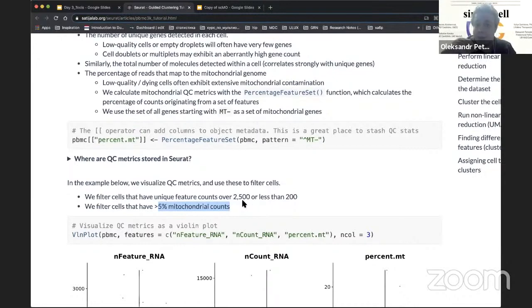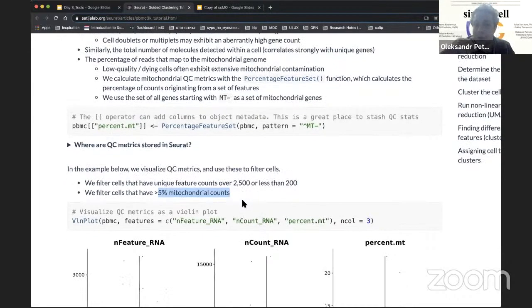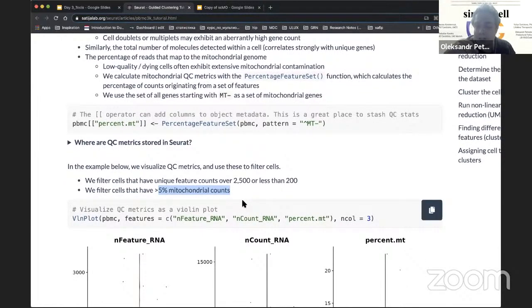For example, the hepatocytes which are located very close to the portal tract. If you take a look at papers from a few years ago on single cells in liver, you can find that they use 20-ish% mitochondrial content filters. Nowadays, in some papers, people even use 35% if they specifically look for these hepatocytes. Just one of the examples.